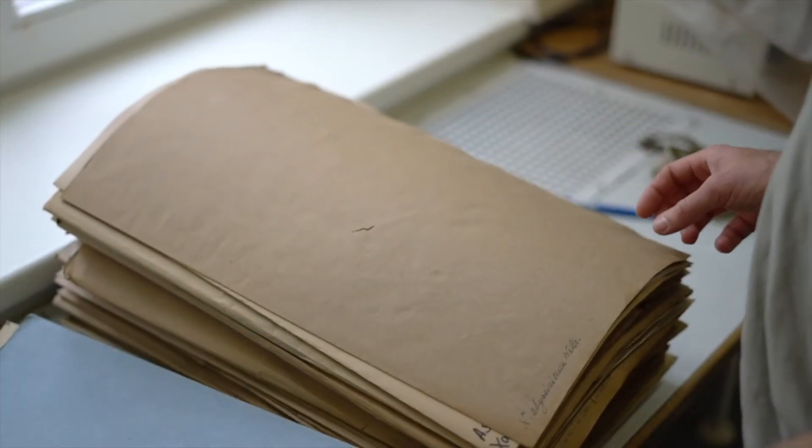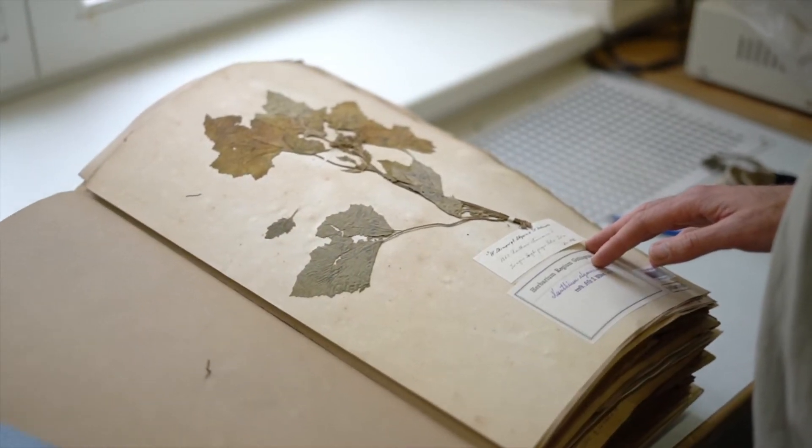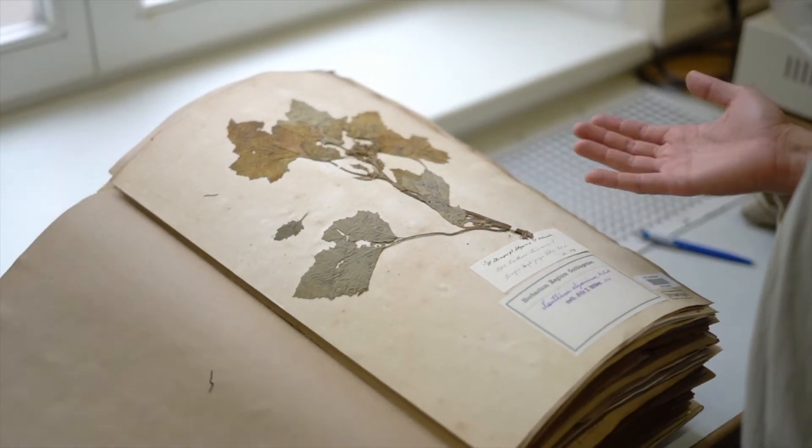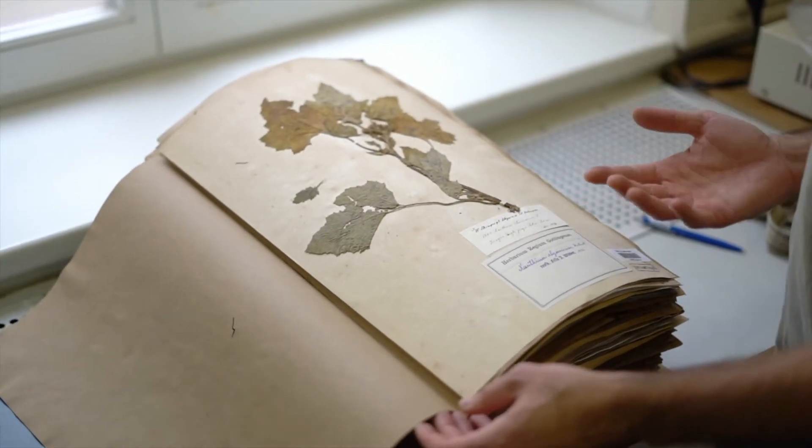This herbarium has about 700,000 specimens, most of them from the 19th century. This is an old specimen that was collected in 1871, presumably in Ethiopia.